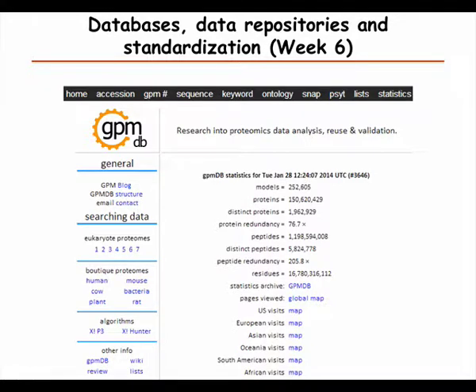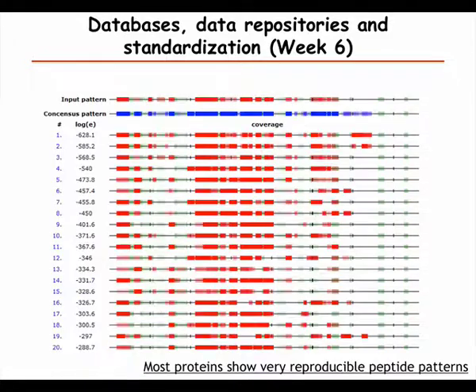The idea, the same as other crowdsourcing efforts, is that by having a lot of data, one can structure it in a way that it's useful. People can use this, first of all, before doing an experiment: if you're interested in a protein, you can go in here and see what other people have observed, or one can validate results.